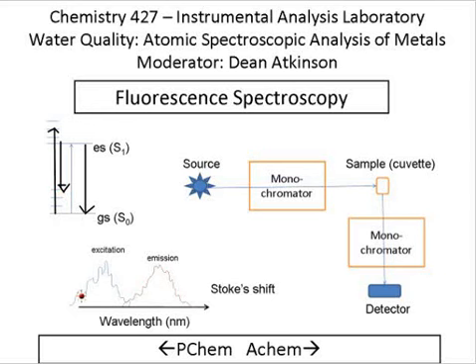And so what I've sketched down here is sort of an artist's conception of what those spectra look like. So the excitation spectrum is all the different wavelengths of light that can be used to promote the molecule from its ground state to its excited state. And typically, you know, some of them are better than others. Some of them have higher population than others. Some of them have higher line strengths than others. If you don't know those words, don't worry about it too much, but you are a senior in chemistry, so we sort of assume you've heard those terms before.